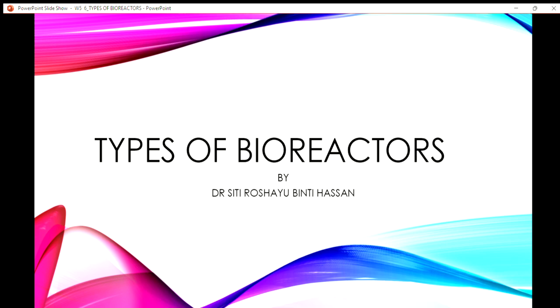Okay, so today we're gonna continue our lecture. Okay, so the topic for today is types of bioreactor.